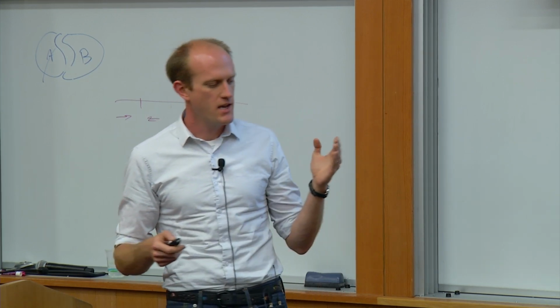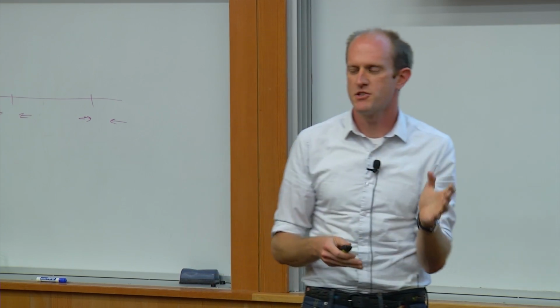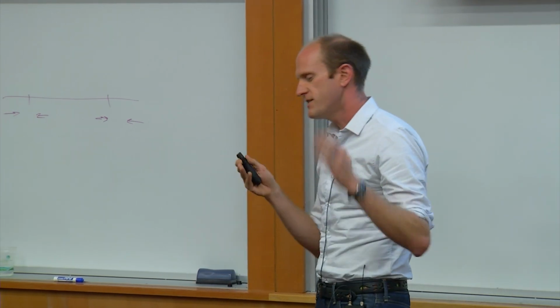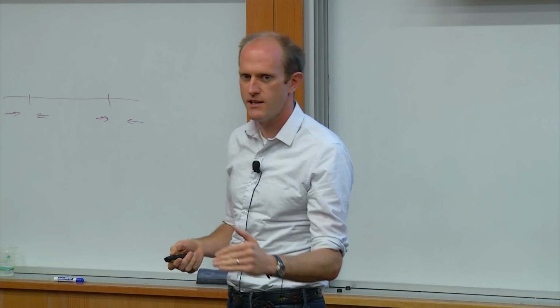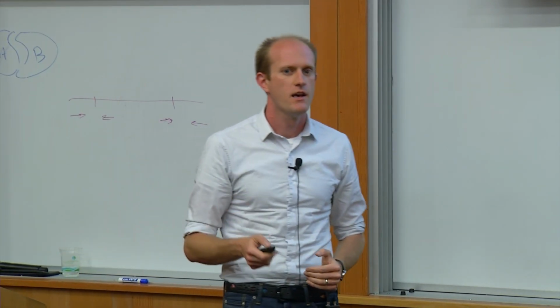So you might say, here's a feature for T at this position, and G at this position, A at this position. Well, what does it matter, right? If I have a T at this position and it's not affecting anything, it's going to get a low weight. If I have a G at this position and it's making a big difference, it's going to get a big weight. Okay?